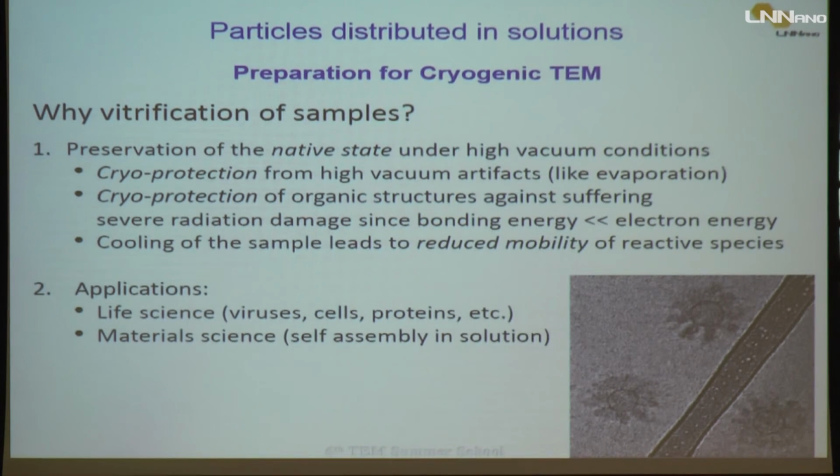If you have, for instance, a polymer particle that is intumesced with water, when you go to the ultra-high vacuum, it's very common to see it shrinking under the microscope, and cryogenic preparation will not have this problem.